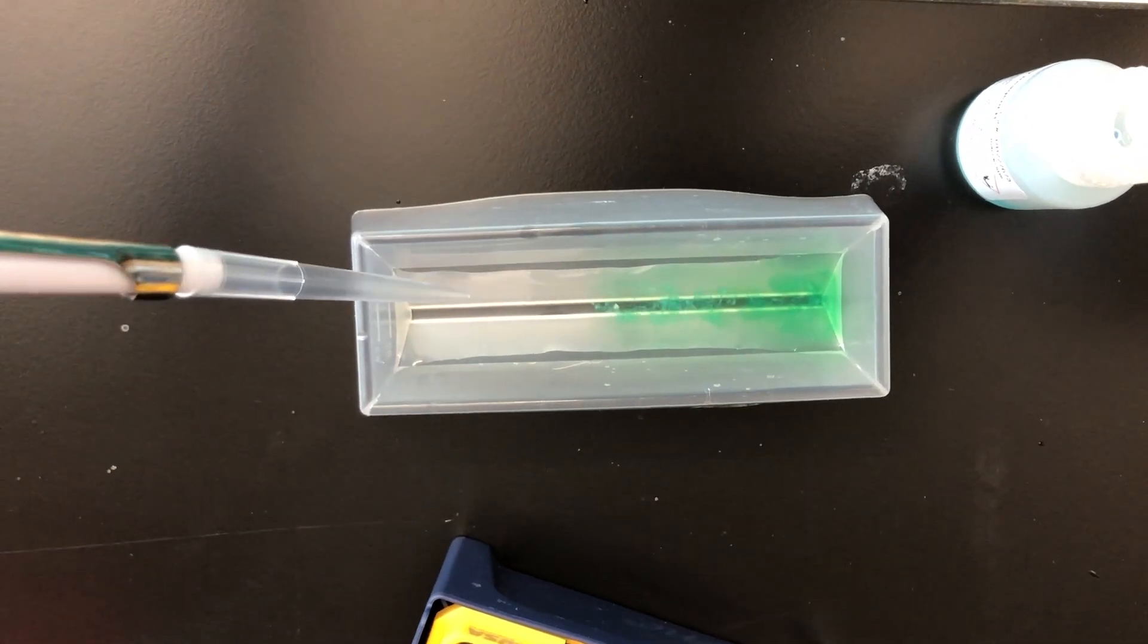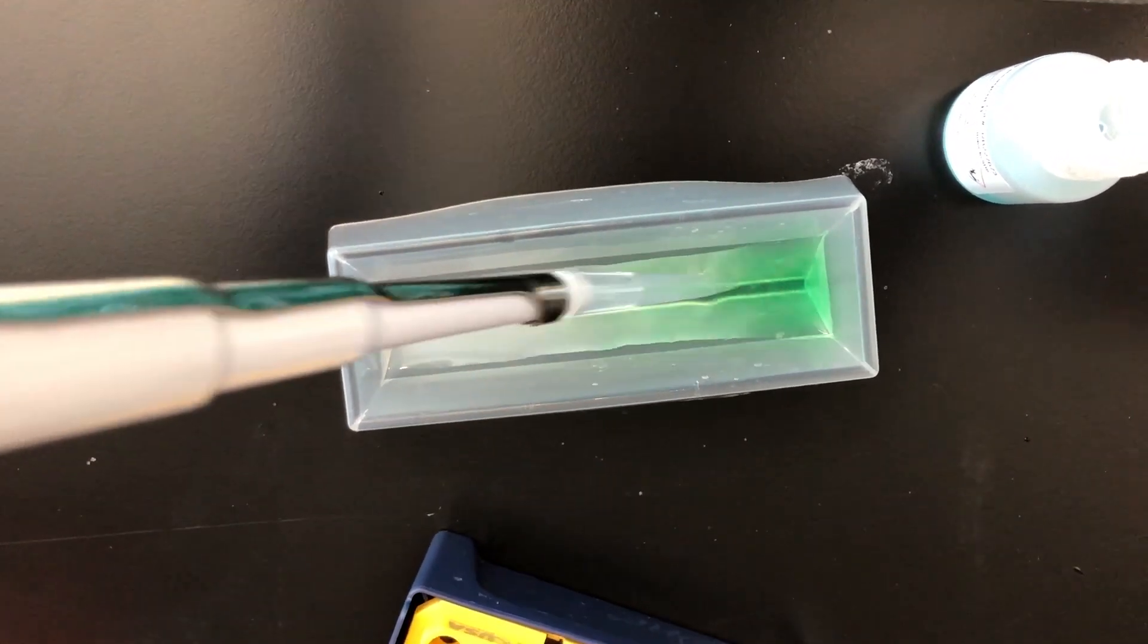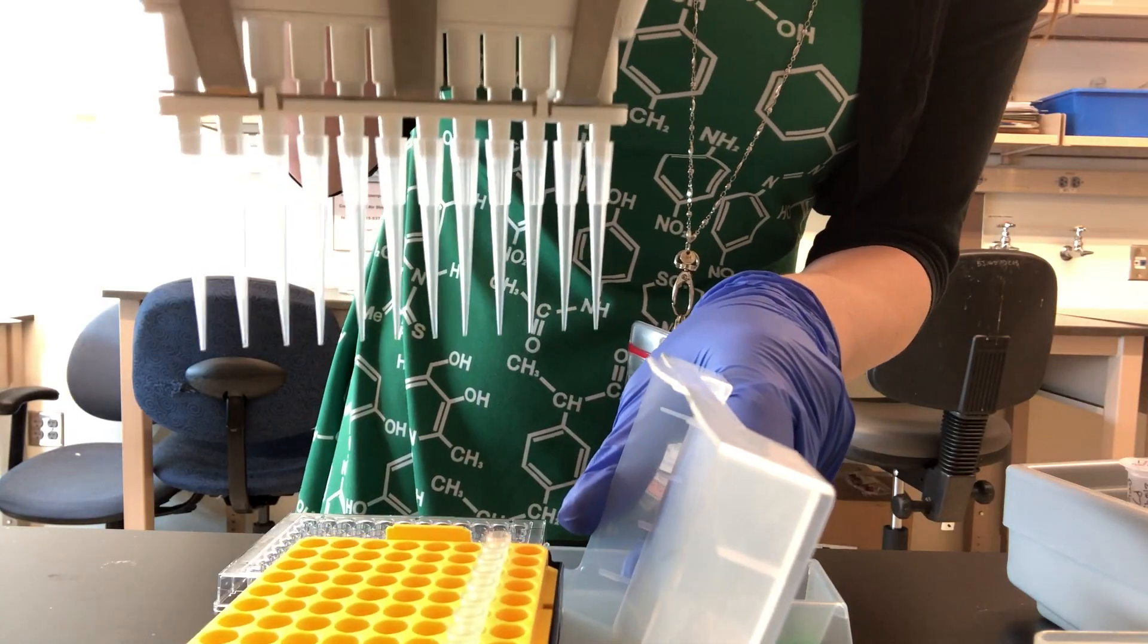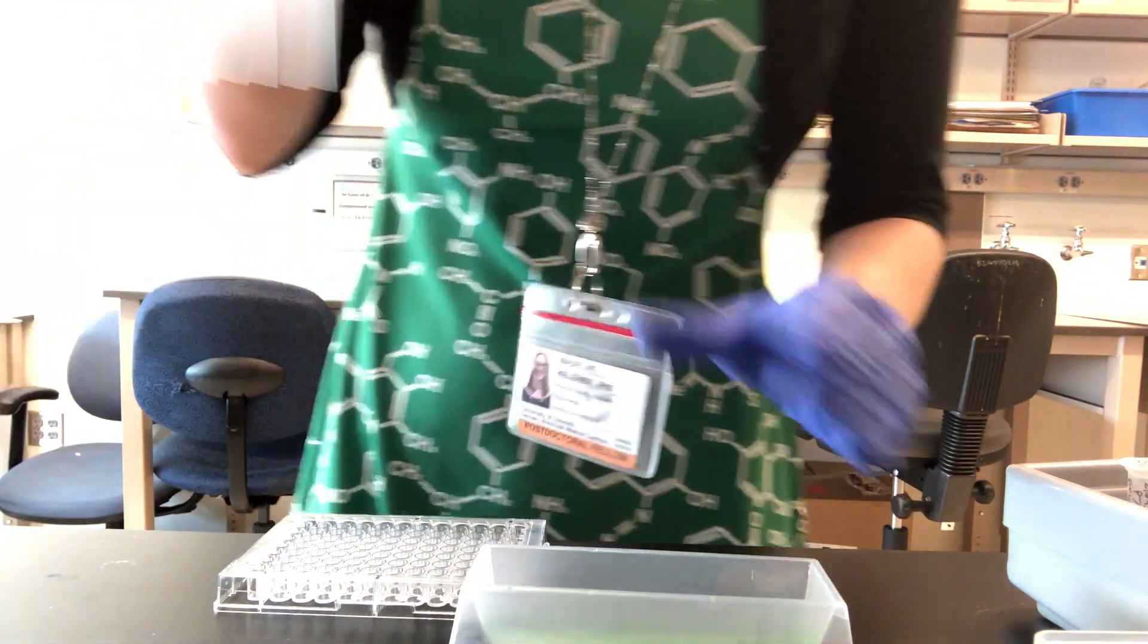So I add a mixture of reagent A and reagent B to each of the wells on my plate. This can be done quickly and accurately with a multi-channel pipette, which adds the same amount of liquid to 8 wells at once.